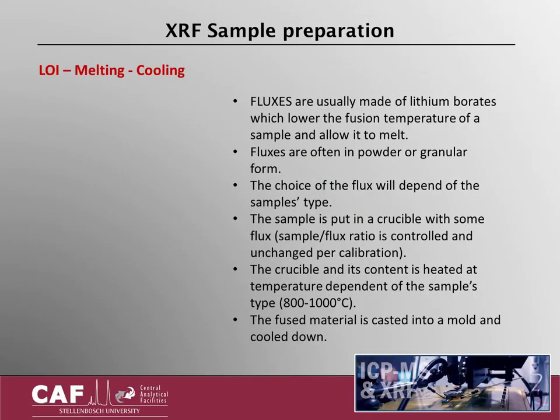Fluxes are usually made of lithium borate mixes and are classified in their ability to react with either a more acid sample or basic sample. Acid samples are high in silica, aluminium, iron or sulfur oxide, whereas basic samples are high in calcium, magnesium, potassium and sodium oxides. The choice of flux will thus depend on your sample type.